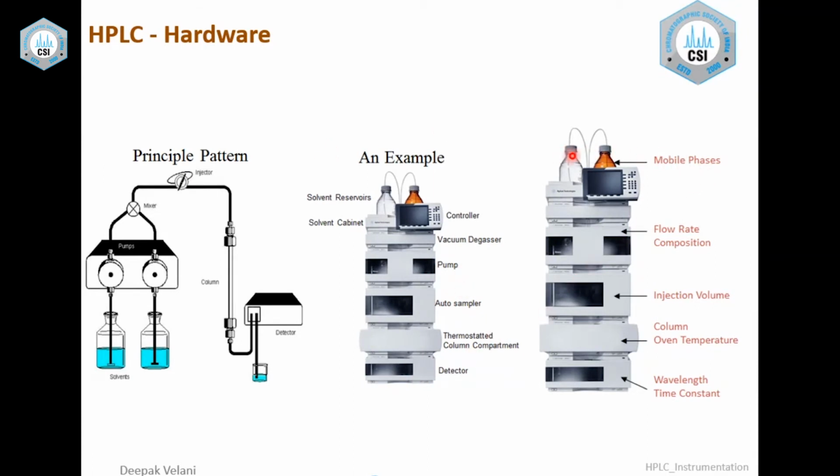So now, solvent tray: you have a mobile phase. The pump gives you the flow rate and composition of the solvents for the separation. The injector provides cooling of the samples and injection of the sample as desired or as per the method requirement. So it handles storage of the sample, storing it in the appropriate condition, and injecting it.